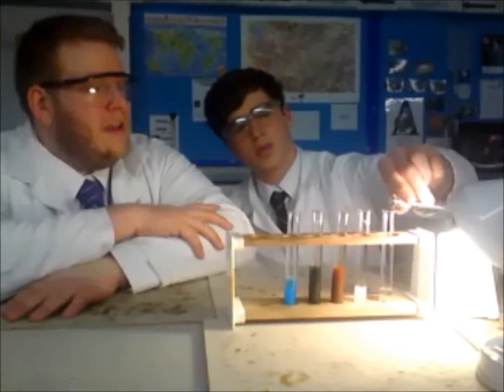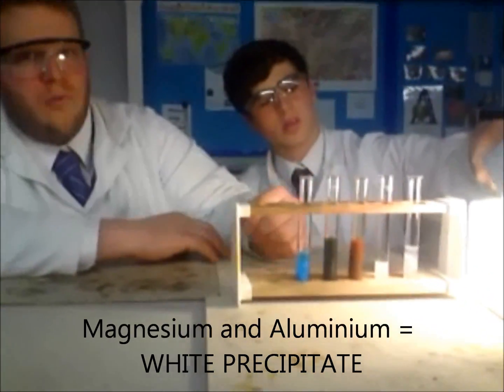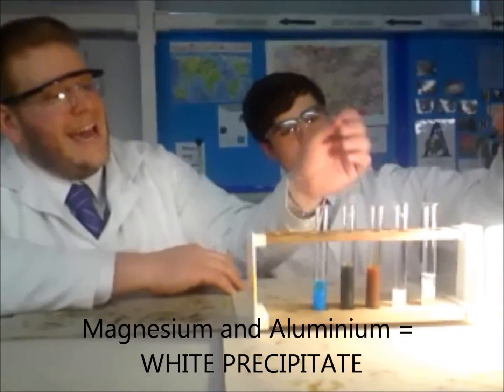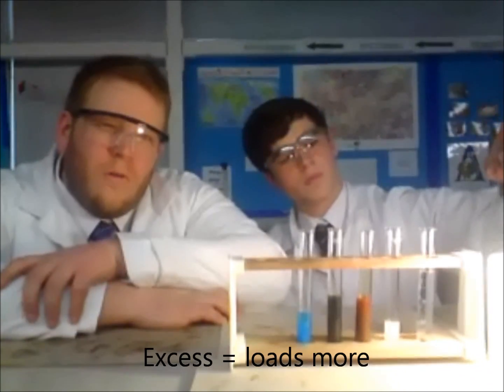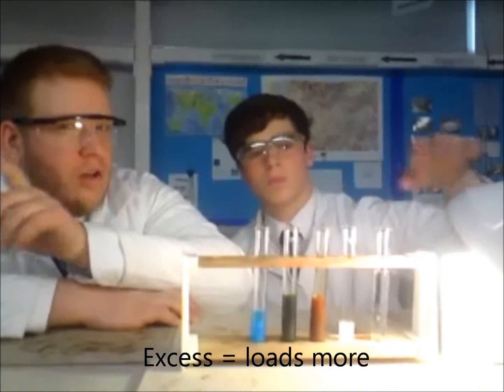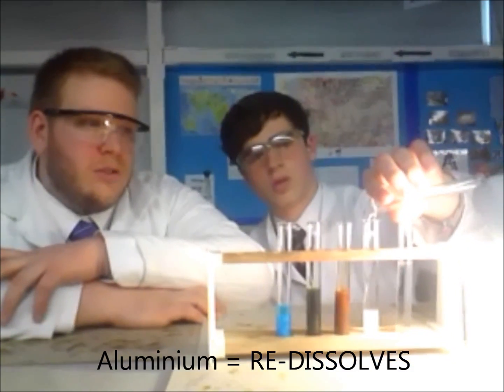Magnesium and aluminium give their own challenges. Their precipitates look pretty much the same, but if you add excess sodium hydroxide to them, you can re-dissolve the aluminium but not the magnesium. So that's a way you can tell the two ions apart.